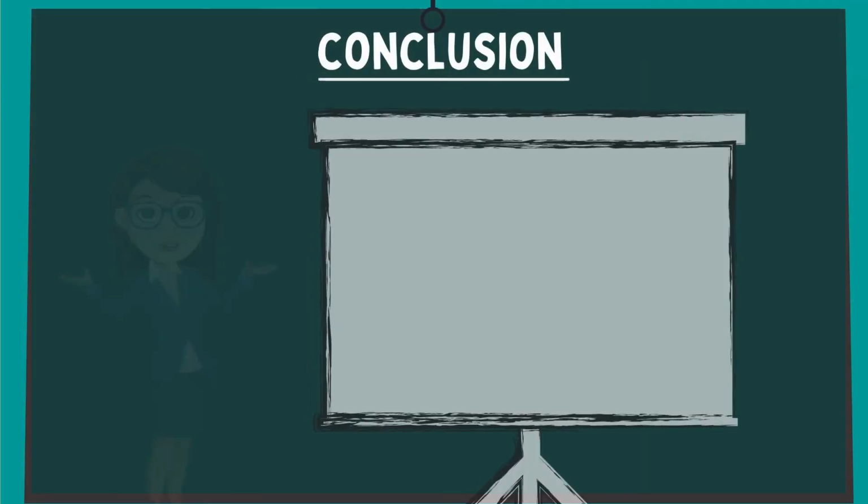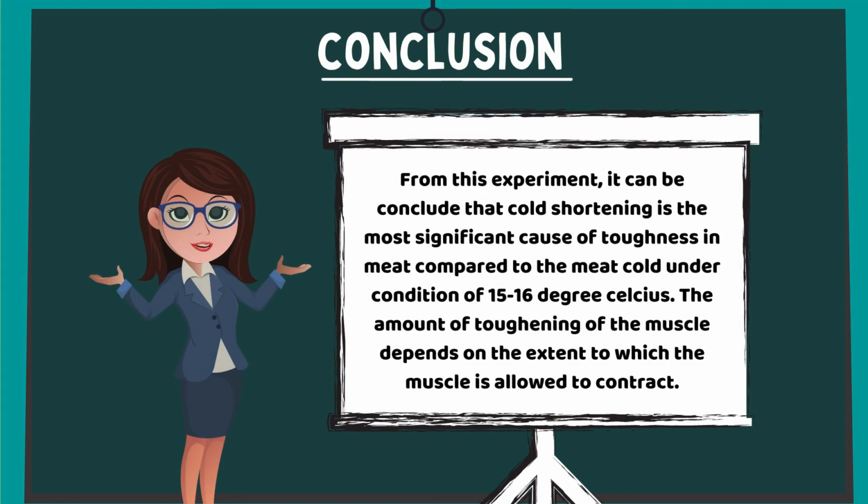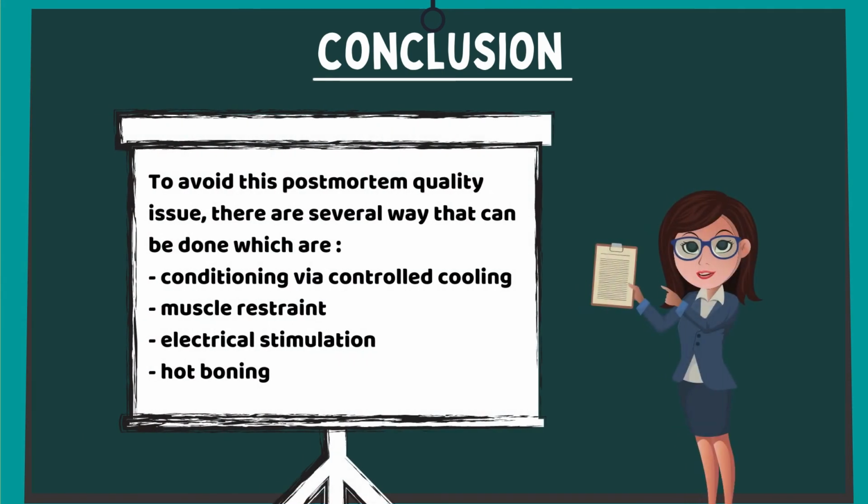isoelectric point. From this experiment, it can be concluded that cold shortening is the most significant cause of toughness in meat compared to meat chilled under the condition of 15 to 16 degrees Celsius. To avoid this postmortem quality issue, there are several ways that can be done, which are conditioning via controlled cooling, muscle restraint, electrical stimulation, and also hot boning.